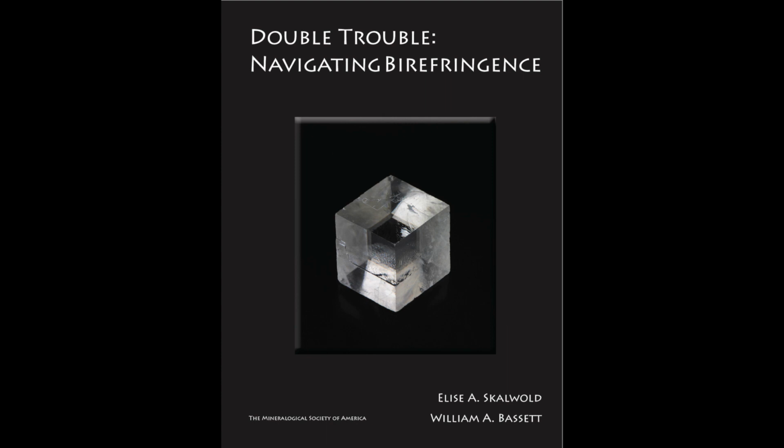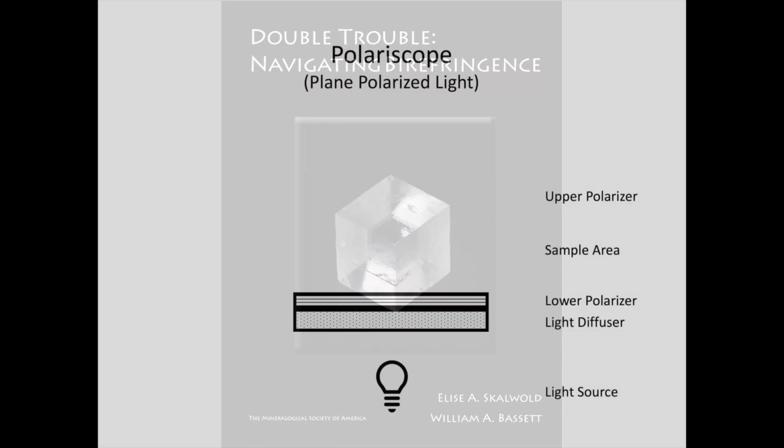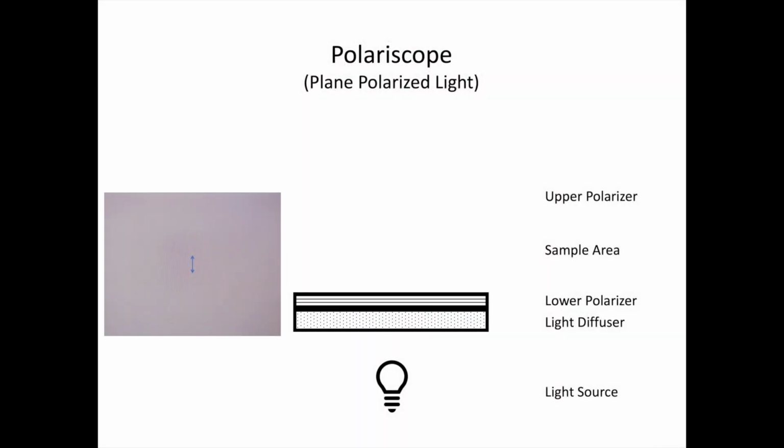With that all being said, let's take a look at the spinel and tourmaline from our kit using transmitted plane polarized light. So just to remind you, that's using this configuration of our polariscope. And also, we're going to be a bit more zoomed in than we were earlier, so the crystals appear larger than they are. So when we're looking at these crystals in plane polarized light, the phenomena we're going to try to observe is known as pleochroism. And the way we're going to observe this is by rotating our crystals while transmitting plane polarized light through them.